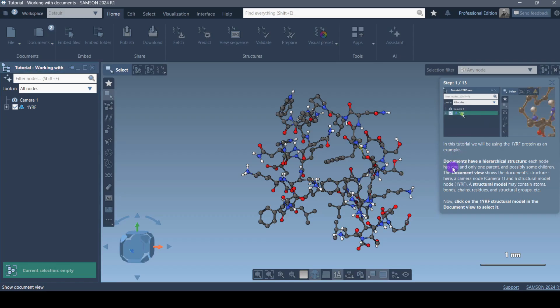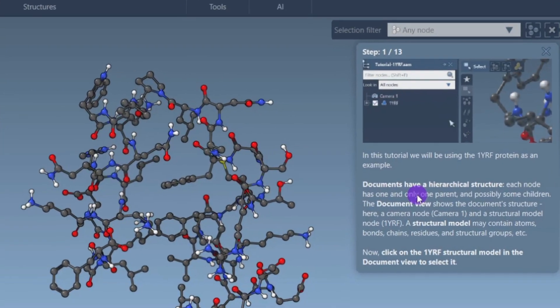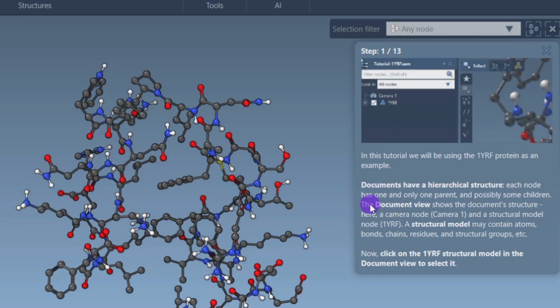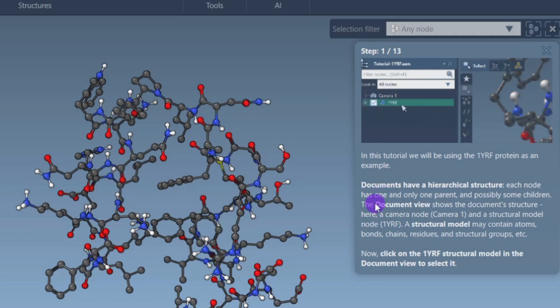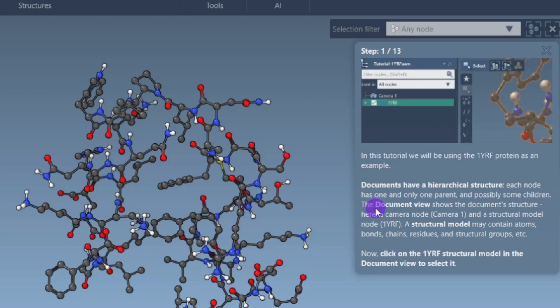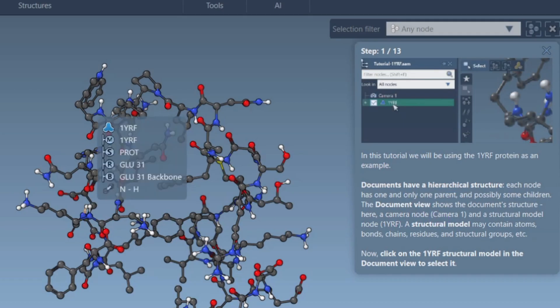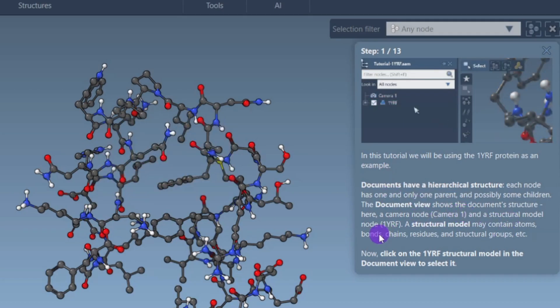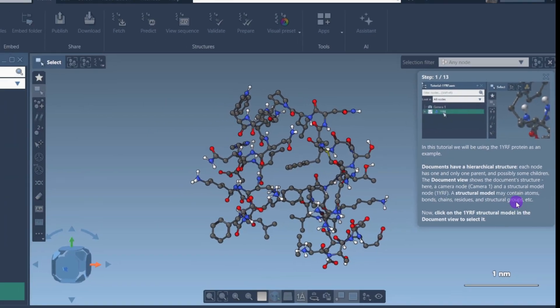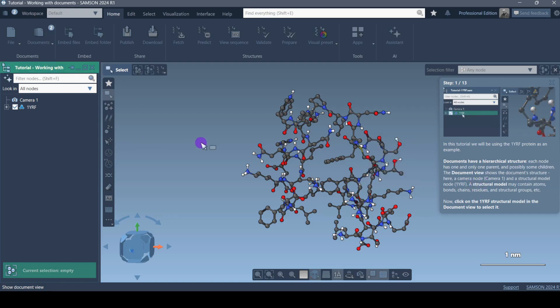If you're not able to understand, you can read the instructions. For example, it's talking about SAMSON documents: 'Documents have a hierarchical structure — each node has one and only one parent, and possibly some children.' So only one parent will be there for each document, and then possibly some children. Let's see the document view — it shows the document structure. Here we have a camera node called 'camera one' and a structural model which is '1YRF' — this is possibly the protein PDB file.